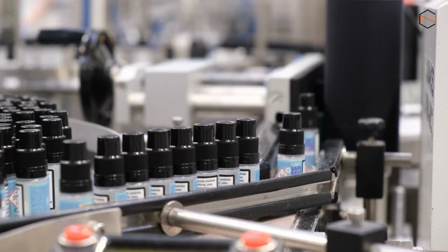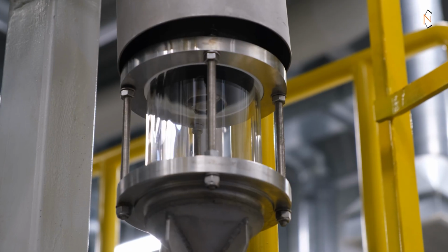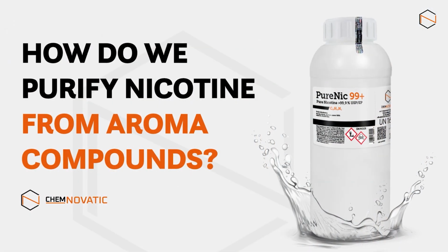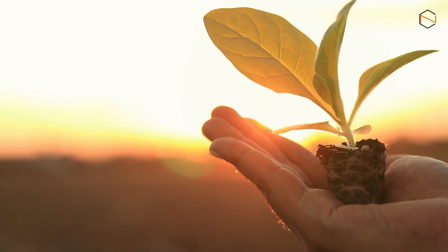Specifically, we will look at the aspect of removing the aroma compounds found in tobacco leaves that have the most negative impact on the odor of pure nicotine. Learn how nicotine is purified from them in a controlled, multi-stage process. Let's start our journey at the beginning.